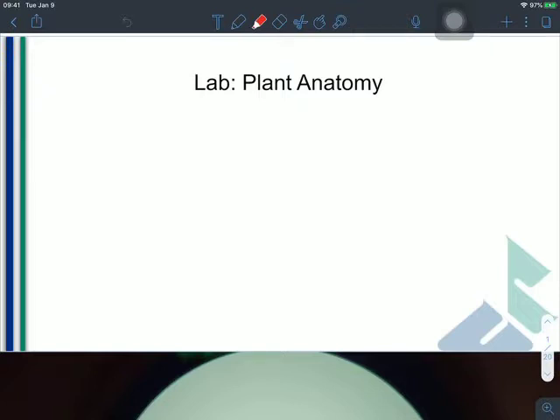So, to properly conduct this lab, you should be looking at these images and pausing the video regularly, as different samples are going to need to be drawn in pretty good detail. The lab video will be relatively short because I want you to spend some time drawing what you see and paying attention to the different tissues. So let's go ahead and get started.